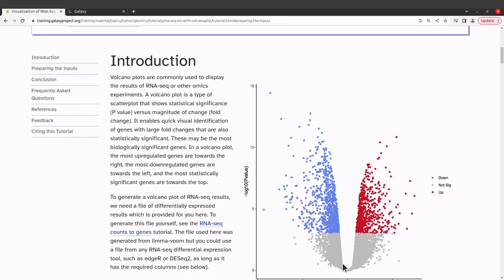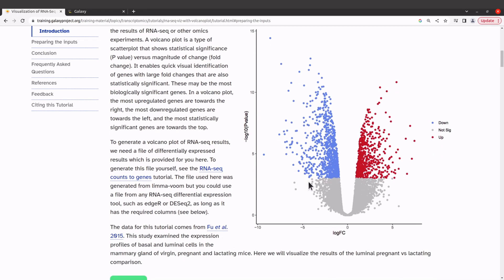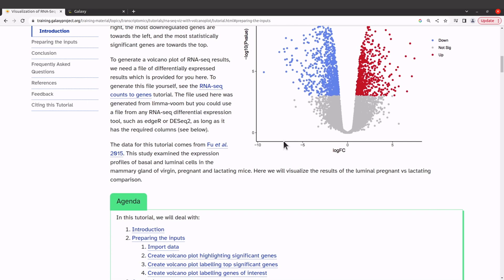A typical volcano plot has three colors. The blue color represents down-regulated genes, the gray color represents genes that are not significantly expressed, and the red color indicates up-regulated genes. This allows you to see these groups of genes clearly. Try to read the introductory material, especially if you're a beginner.